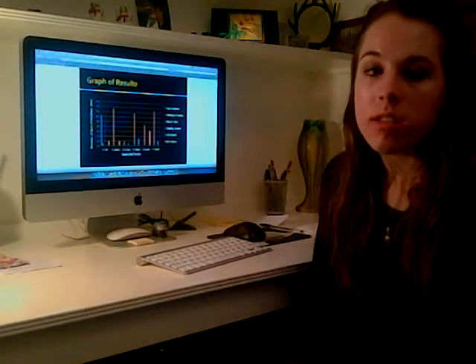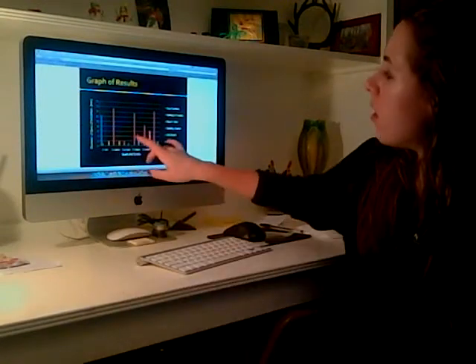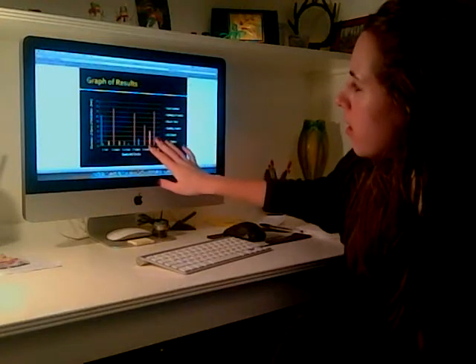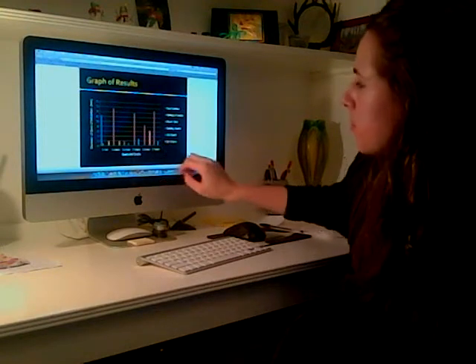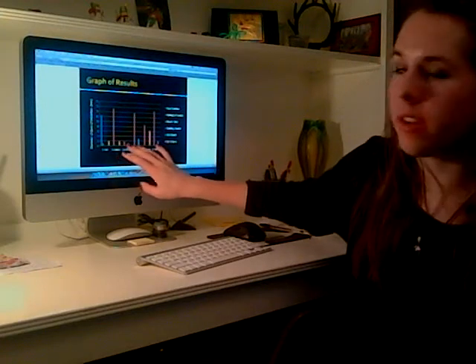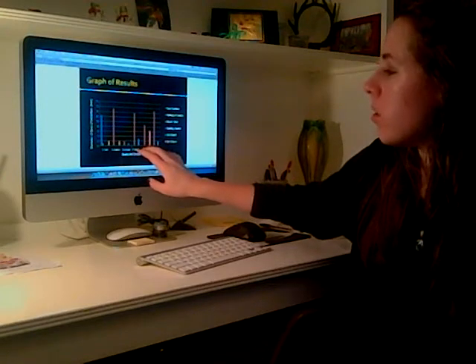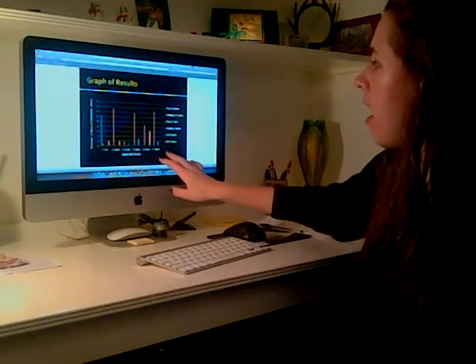In this graph of results, the chart clearly shows that hydrogen peroxide's effects were much greater than any of the other antiseptics or disinfectants tested. It also shows that spick and span were effective against about half of the bacterial strains, while 10% bleach was also effective against about half.